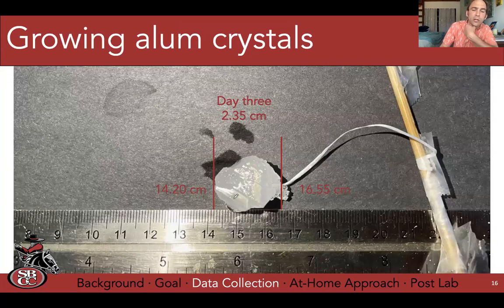You can see as my crystal is growing, it's losing its shape and its transparency, because every time I'm adding to my crystal, I'm not necessarily adding exactly to the same lattice, because we have some disconnect in the lattice as it cools each day. That error in your crystal lattice grows and grows and grows as the crystal grows. So measure carefully after day 3.